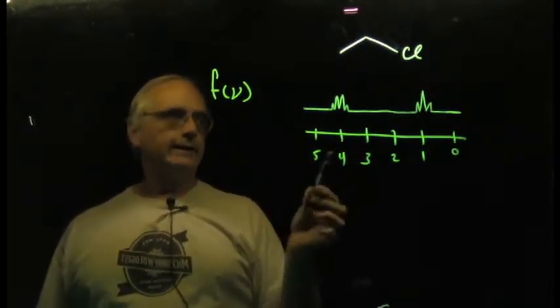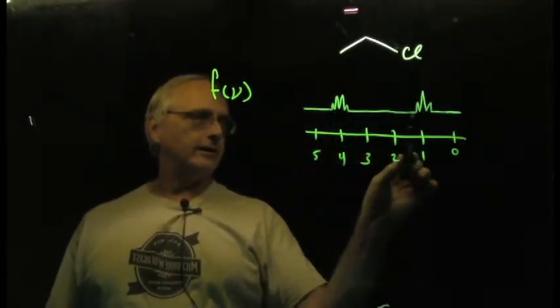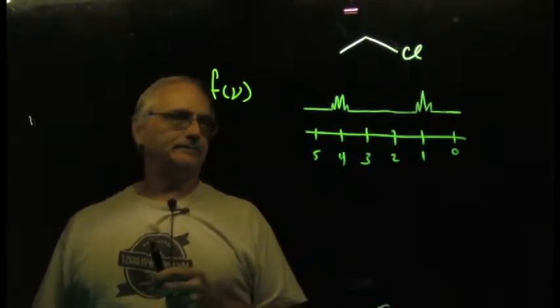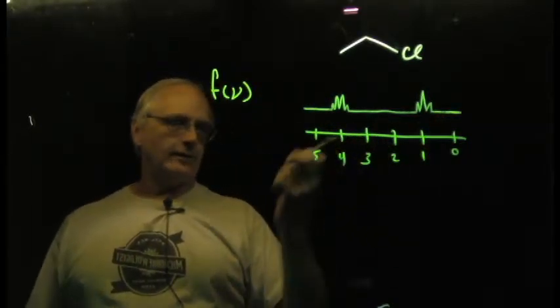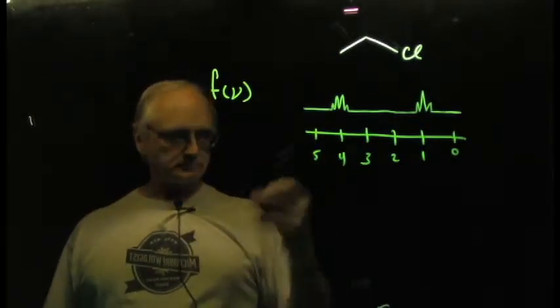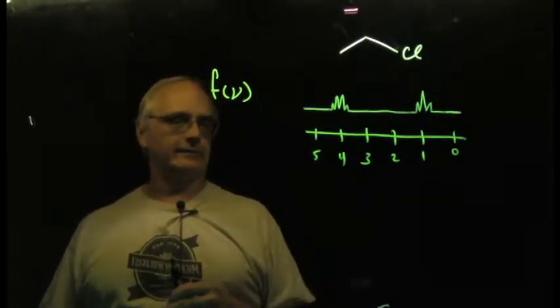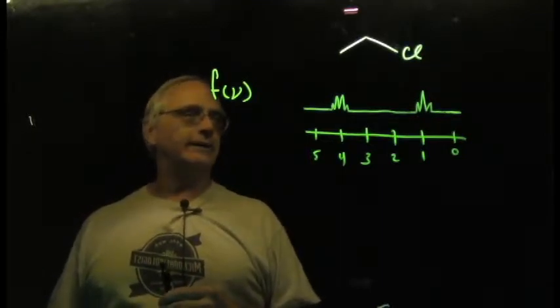So when plotted, it is 0 here, it goes up and down in this region, is 0 again, goes up and down in that region. So this is literally a plot of a mathematical function. And when I first obtain spectra, if I see this show up, let's say in the computer display, when I first run this molecule, I will look at it and say, oh, look, I have two resonances. There must be two groups of distinct protons in this thing. But now I want to count the number of protons within each group.